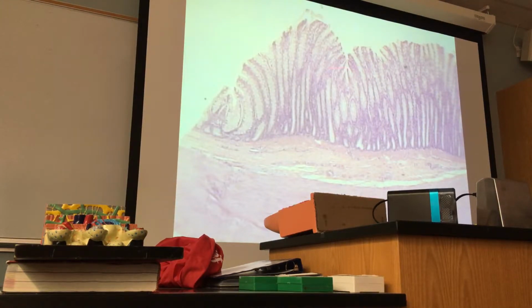Now, the glands in large intestine or colon are formed of 2 types of cells, just 2 types. If you look at, what is the page number? It's 926 right now. 926, and on the other side? 927. In 927 you can see 2 types of cells. One is called goblet cell, another is absorptive cell. So I'm going to focus on that under higher magnification.